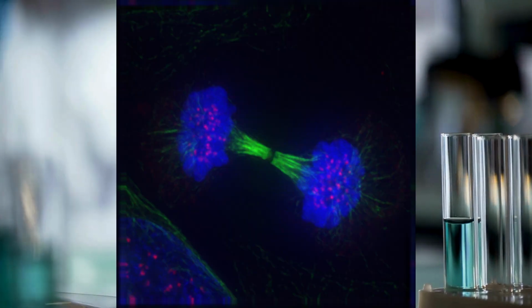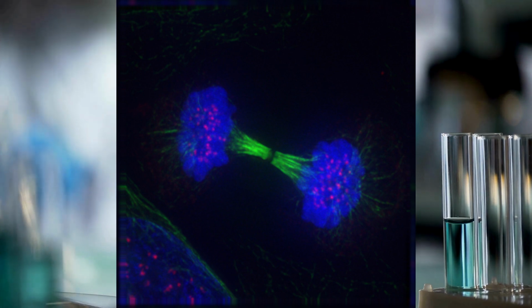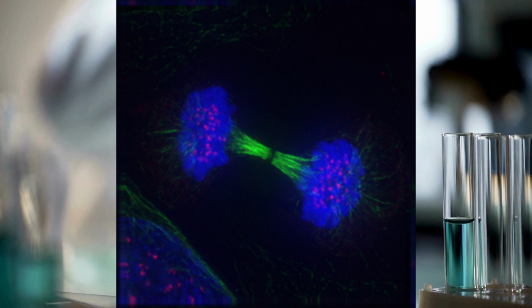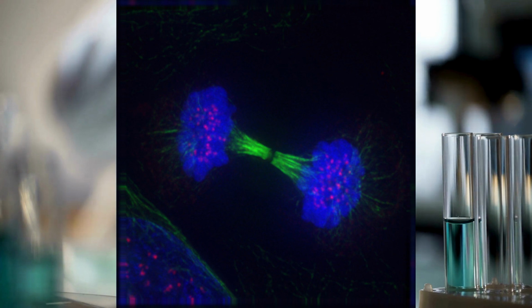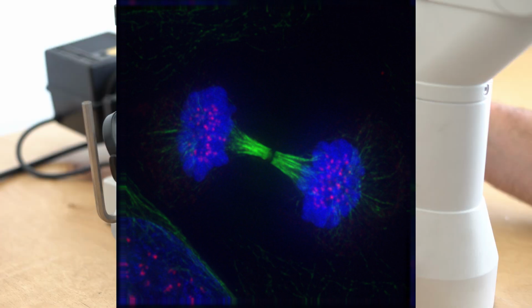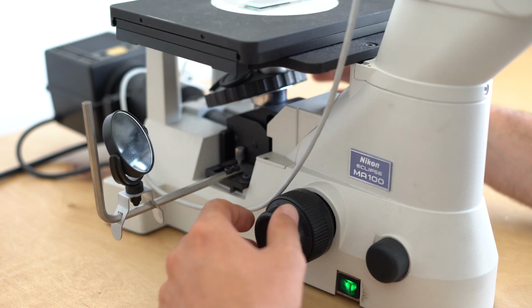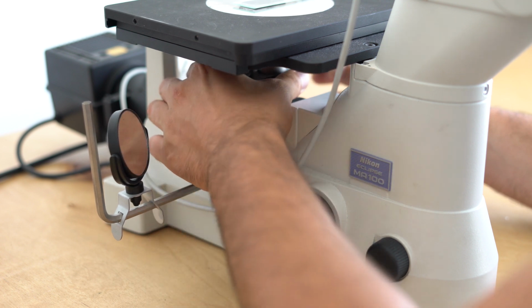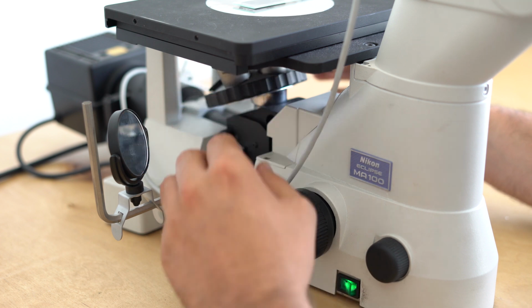This is what fluorescence microscopy is. It's a process of creating highly detailed and specific images using either integral parts of the cell or organism, adding parts, or staining, but importantly, you're only looking at specific elements of anything you're trying to examine, because everything else doesn't really show up, and that's the challenge here. It's a brilliant technique and technology in isolation, but it's also somewhat isolated in its application in most instances, because it can only account for so much and only what it's able to image.